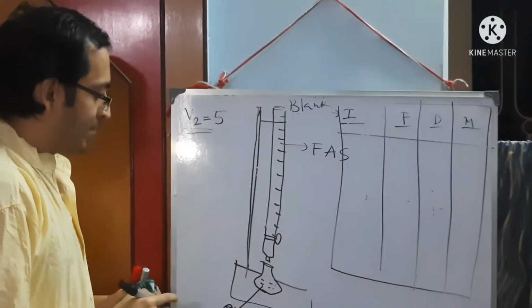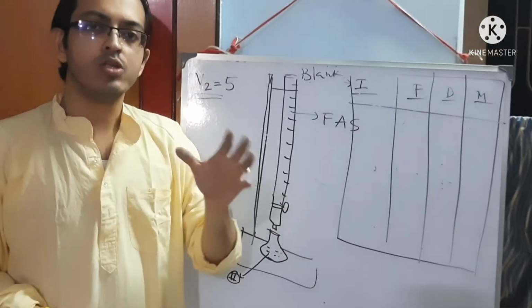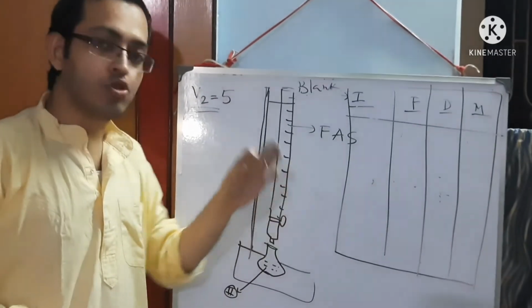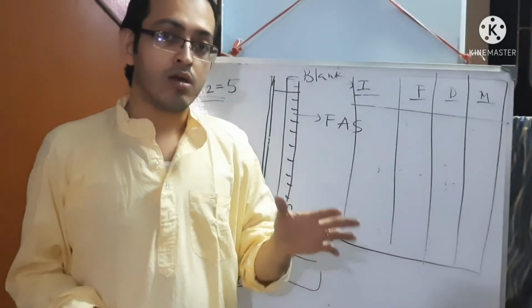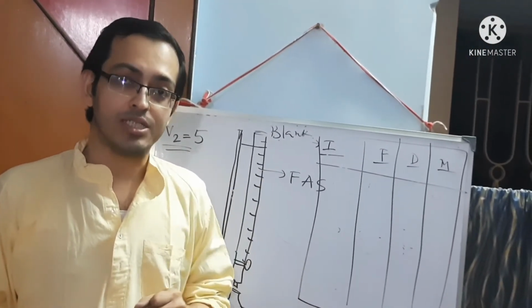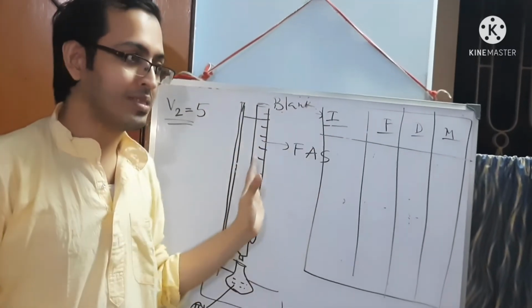The one thing is that before we start our titration, the chemical mixture was yellowish green. So how can you know your titration is complete or not? You add this FAS dropwise, when this yellowish green mixed sample is converted into reddish brown color. That will indicate the end point of the titration, and then note the final reading of the burette. In both cases the color will be same, sample and blank.